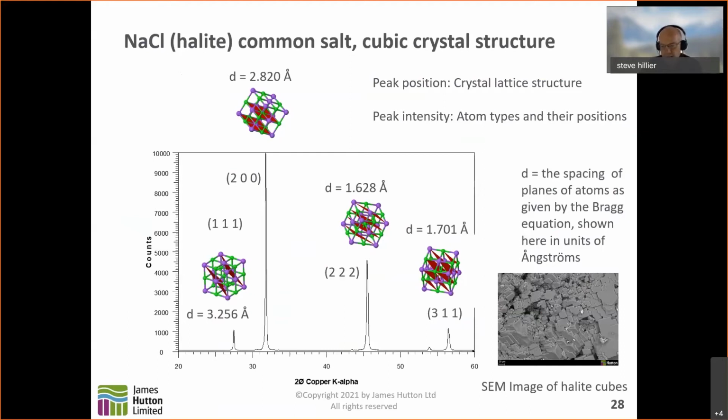And a diffraction pattern is fundamentally a direct fingerprint of what that substance is. It is sodium chloride in this instance because it has this diffraction pattern. It cannot be anything else. I always like to refer to the fact that NASA have sent an X-ray diffraction instrument to Mars. And the reason they did that is because X-ray diffraction is so fundamental in actually telling you what something is.